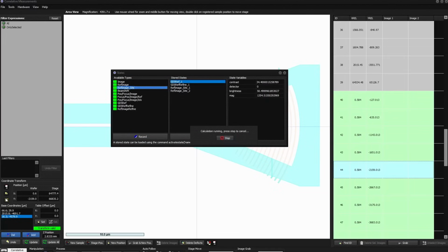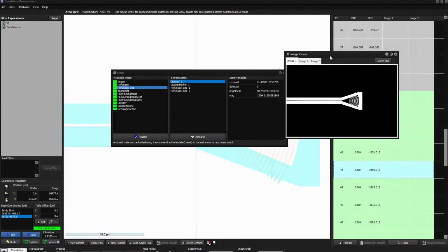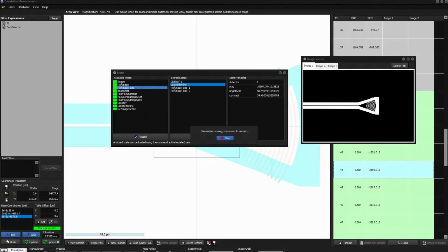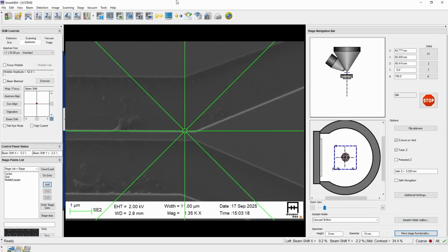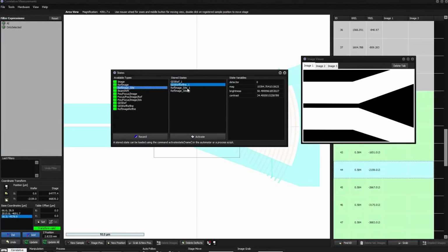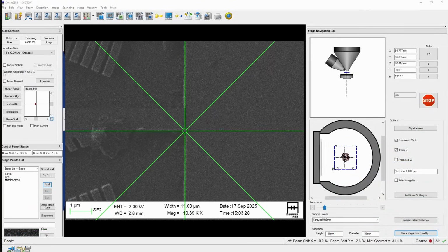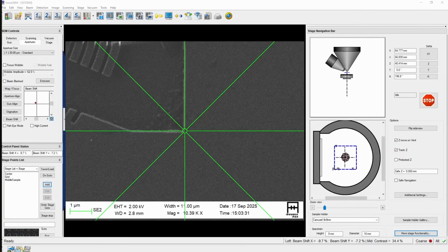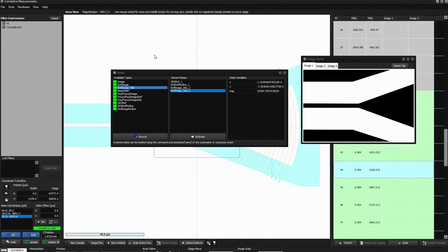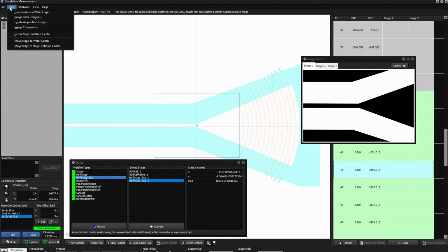So first is GDS reference. This is this one. It sent us our image. Next thing is a refine. Now it sent us here. And then we can go to site 1. You see it's exactly. And site 2. That's how it is. And so we have recorded this 4-step structure and we convert this now into a recipe.